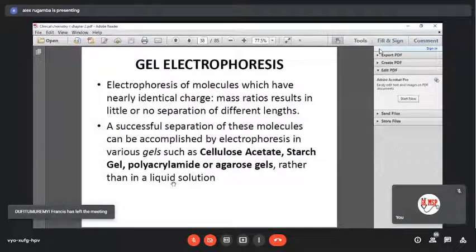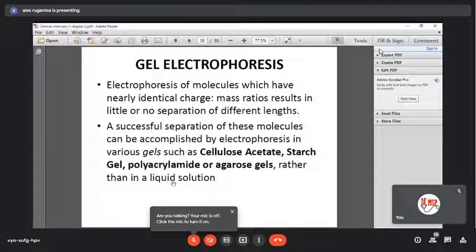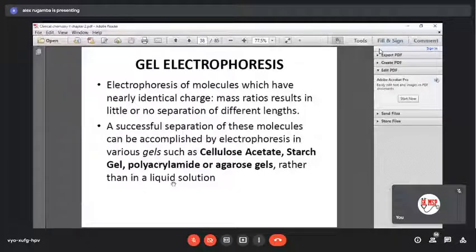According to the size, if we know that our protein has this size, for example, if you are measuring a protein called Janus kinase, JAK2, Janus kinase 2, and we know that Janus kinase 2 has 120 kilodaltons, then after migration we will find that the Janus kinase migrated up to 120 kilodaltons. That's an example.